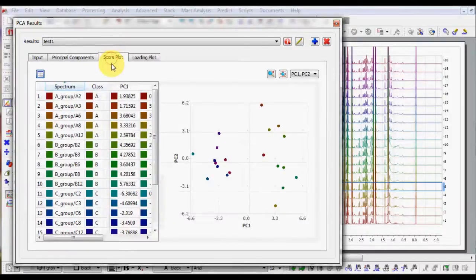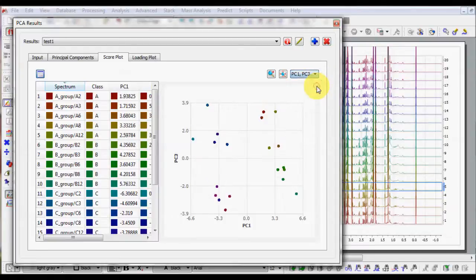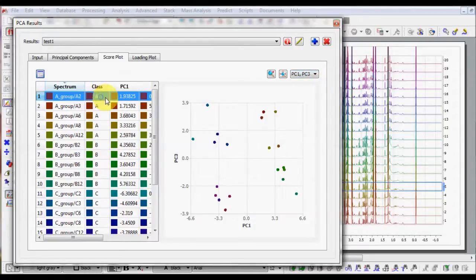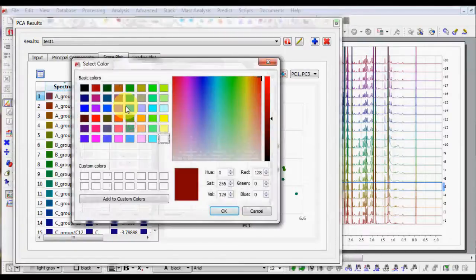In the Score Plot tab are collected the different 2D score plots. By right-clicking on a class definition, you can associate different colors to the different classes.